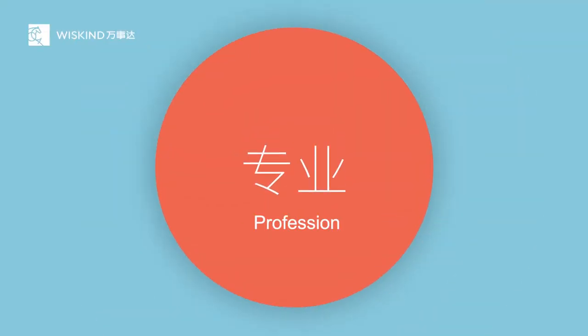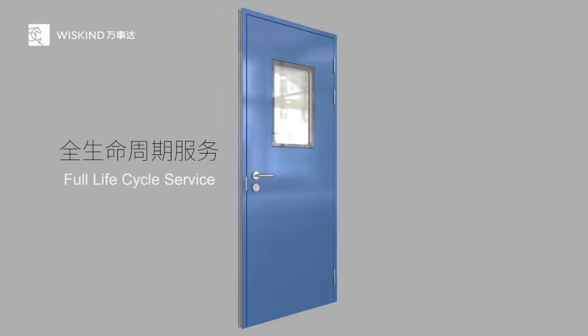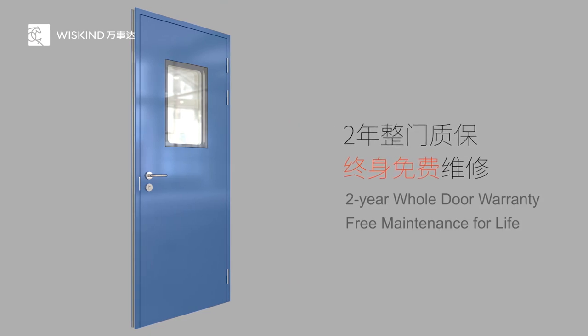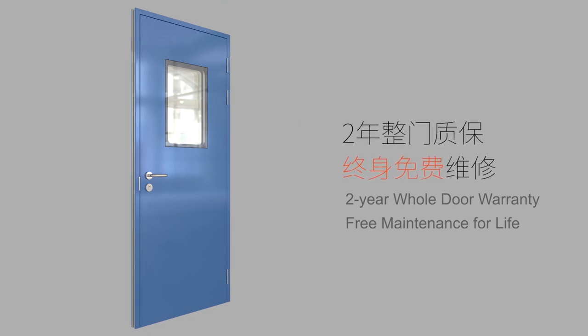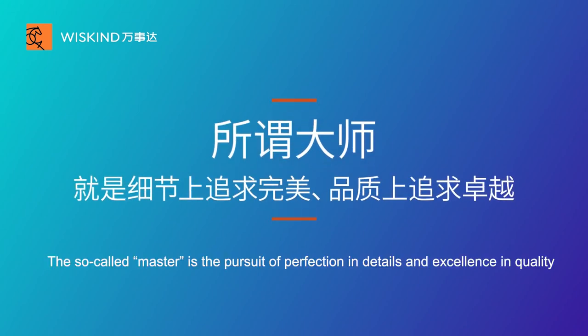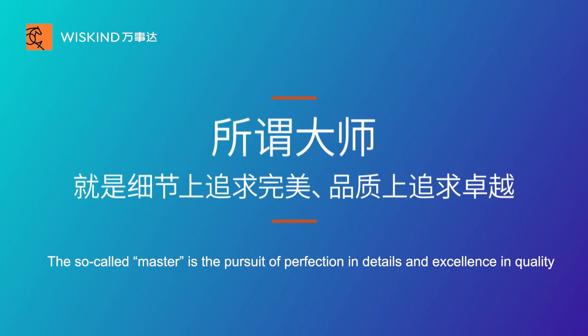Because we are more professional, we are more confident. We provide full life cycle service — a 2-year whole door warranty and free maintenance for life. The so-called Master is a pursuit of perfection in details and excellence in quality.